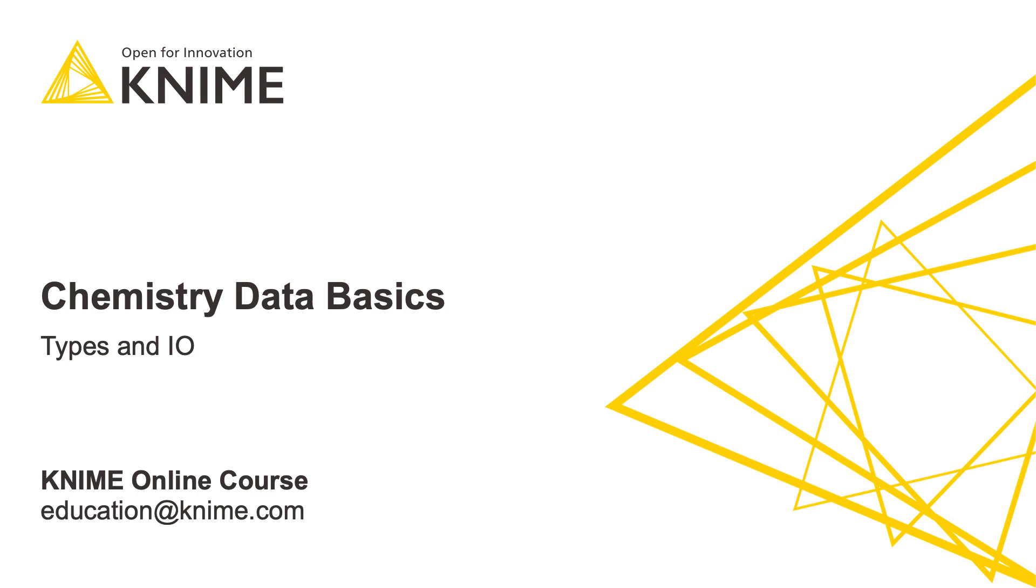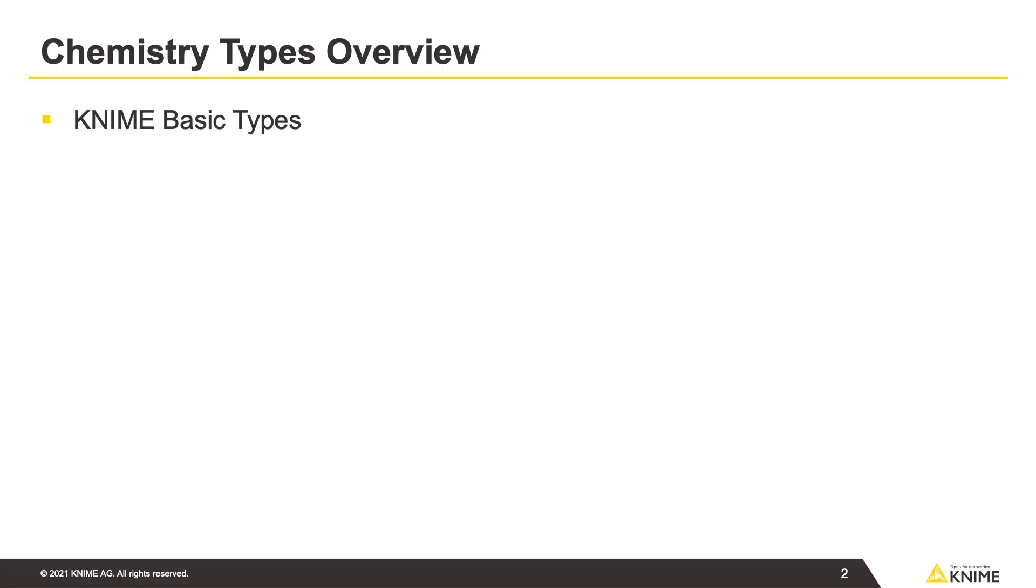In today's video, I'm going to show you chemistry data basics in the KNIME Analytics Platform. First of all, let's have a look at the different data types.